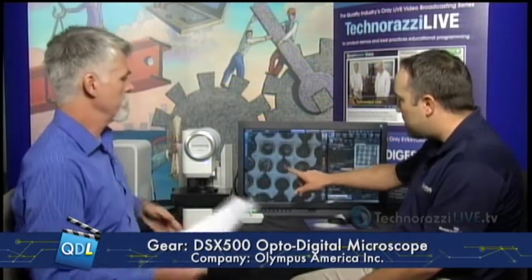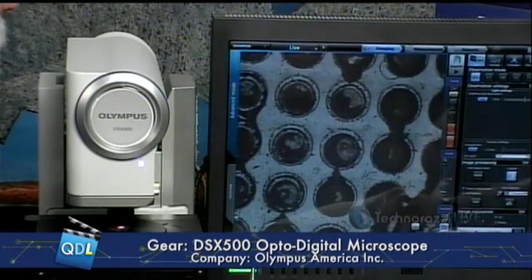Guaranteeing accuracy is a little unusual for an instrument of this type. With most digital microscopes, you can take measurements, but we don't see guarantees on those measurements, and customers are on the line for knowing if their measurements are accurate. Olympus can guarantee this because of the auto-calibration capability, and we go a step further with a built-in gauge R&R — reproducibility and repeatability — tool in the software, allowing multiple users and multiple samples to be tested.